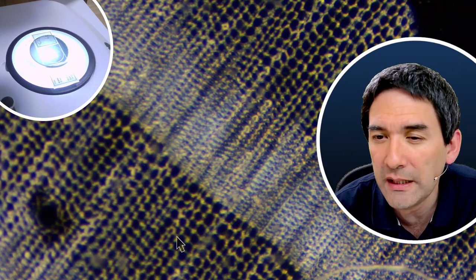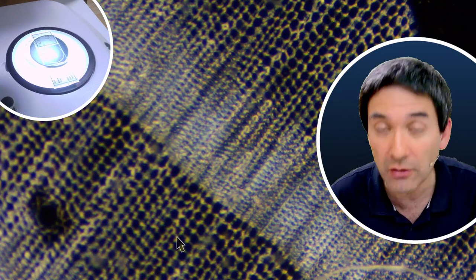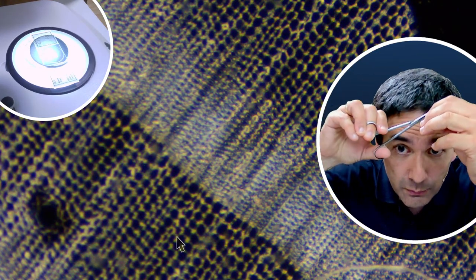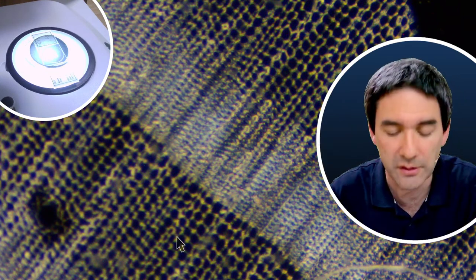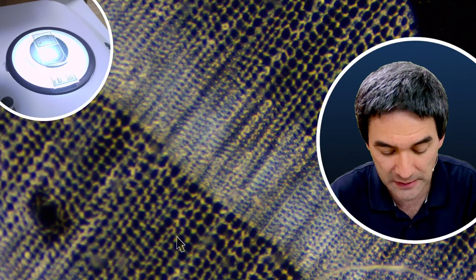If you do one over here also, does it look interesting? Do they maybe have samples of this here? Thank you for the question. You know what? I have no idea. I never observed this under polarized light. So what's the big problem? We'll just try it out. Okay, here is a little bit of it. I just put it on a microscope slide.